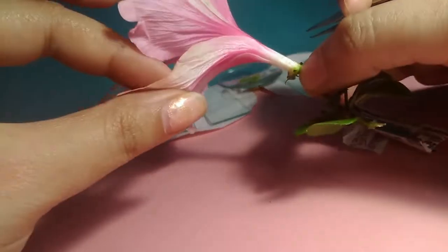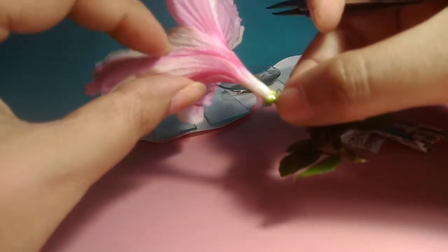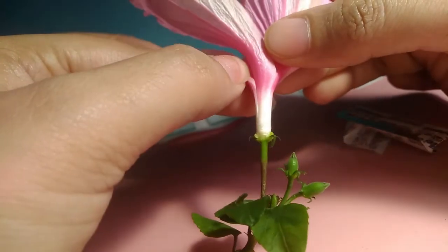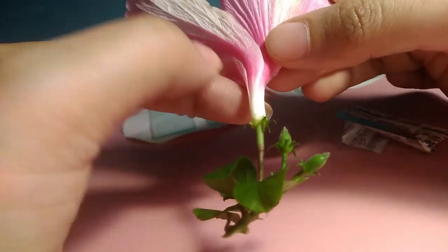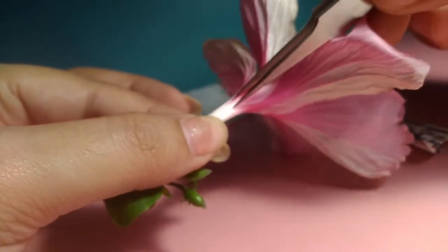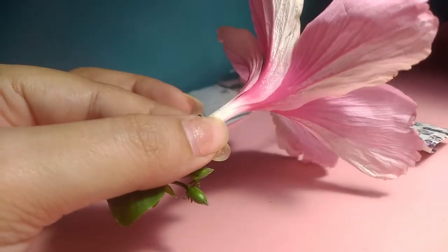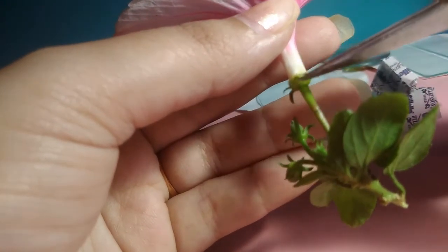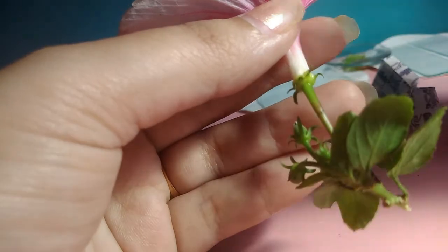Now here we see that we have the petals completely exposed, and these petals are not joined with each other, are they? No, they are all free here. See, they are all free here. So the petals are not joined in hibiscus, but the sepals were. The sepals were joined, but the petals aren't. Okay. Now I have not removed the epicalyx yet. We will do that later.